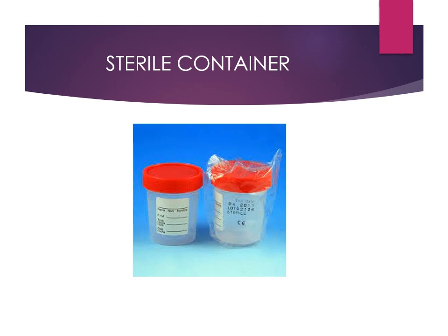Now, the plates which you can use for culturing these bacteria are XLD, DCA and MacConkey agar. If you specifically go for Vibrio cholerae, then you have the bile salt agar. If you go for the selective media, then it is TCBS. So depending upon what answer you are giving, the question will be according to that topic. Now we come to the second spot.